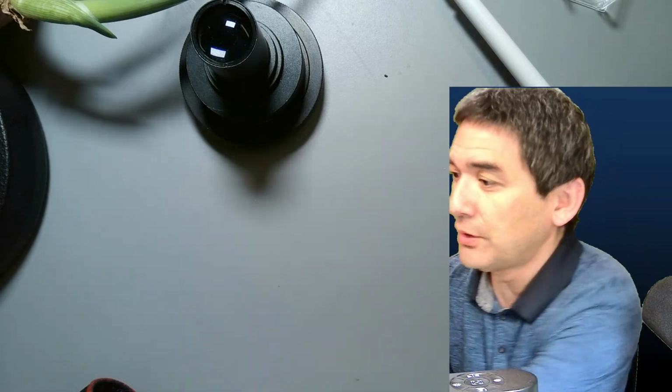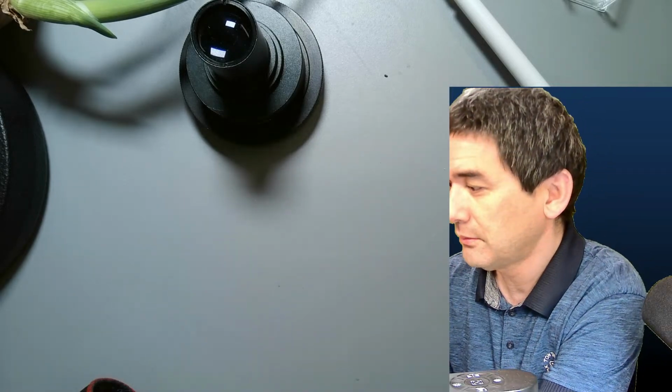I promised, because several of you wanted to know a little bit about my camera setup. And here, this is already the first question: which camera setup? The one on my microscope, or the one over here on the desk? Maybe you're not so interested in the one over here. It's a webcam. So I think you're really more interested in my camera setup for the microscope. So I'm now going to show you the camera setup that I use for my microscope, and I'm going to explain it a little bit.